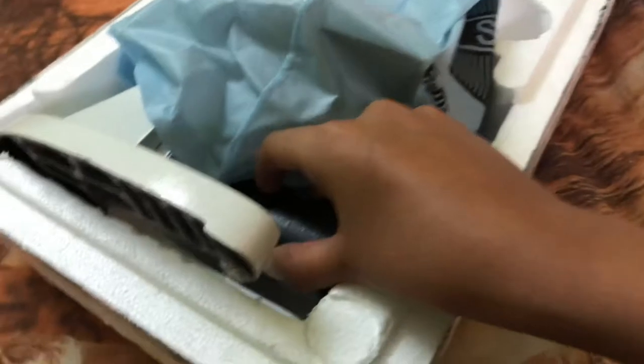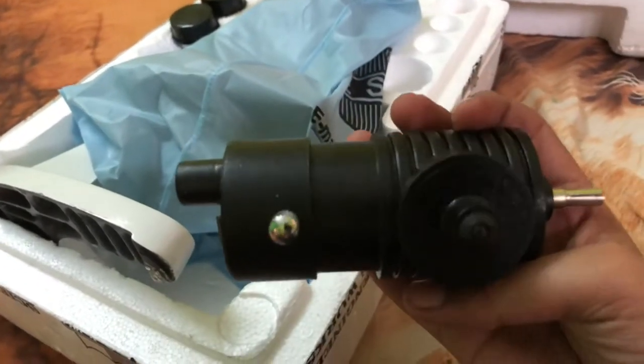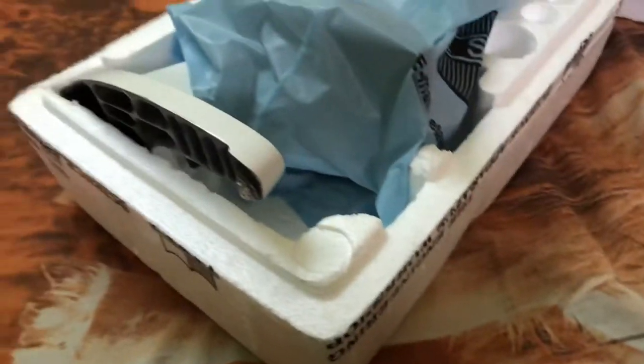This — the microscope body. What is this? Torch. Very well. We are going to need some lighting anyway.